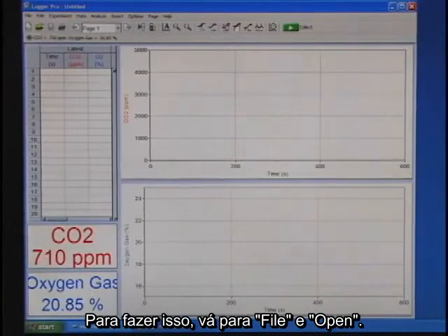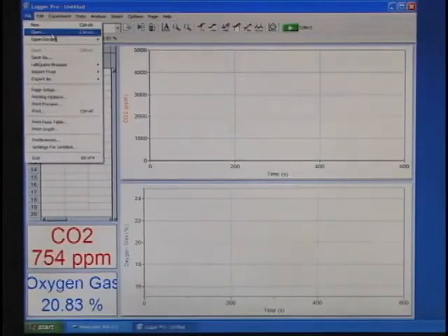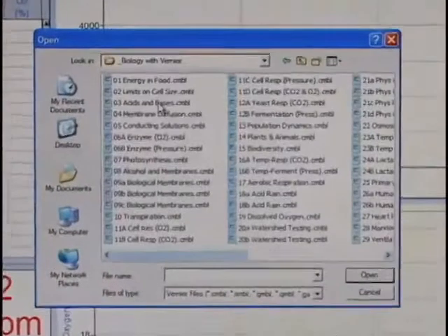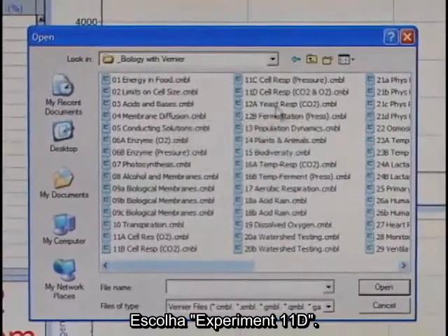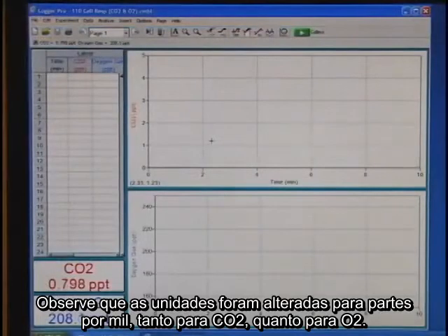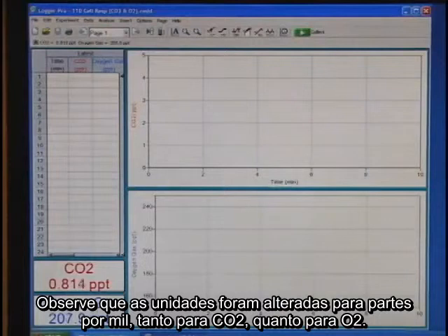To do this, go to File, Open, click Biology with Vernier, and choose Experiment 11D. Notice that the units that are used to measure have now been reset to parts per thousand for both the CO2 and the oxygen gas sensor.